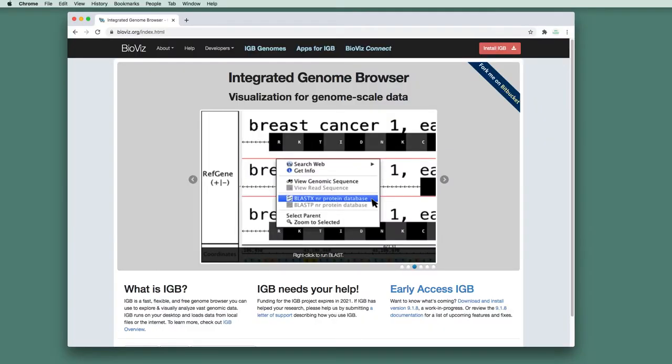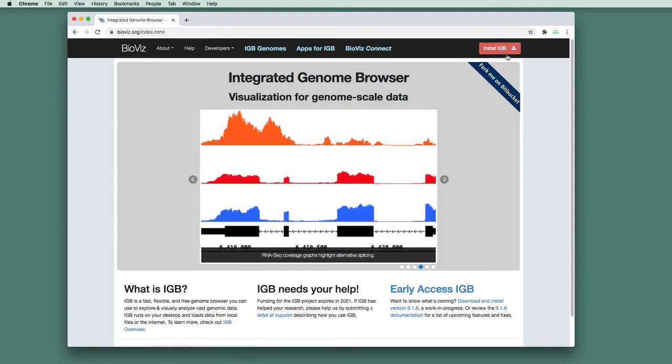Integrated Genome Browser is a native desktop application that you install on your machine by going to our website, bioviz.org, and clicking the Install IGB button.